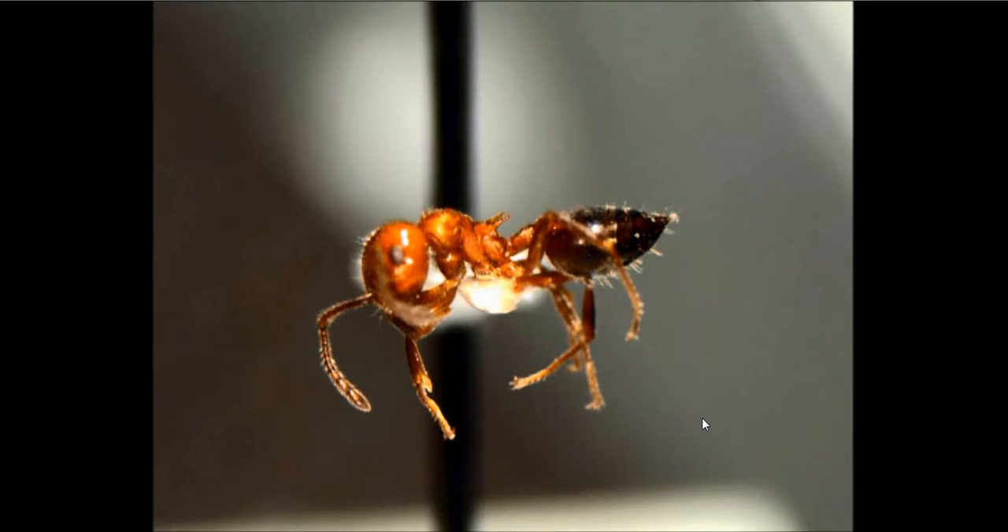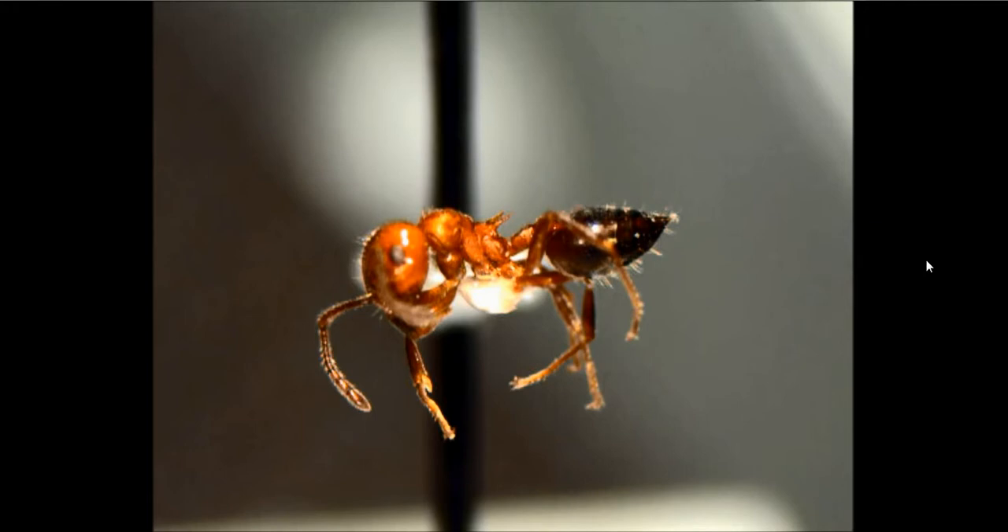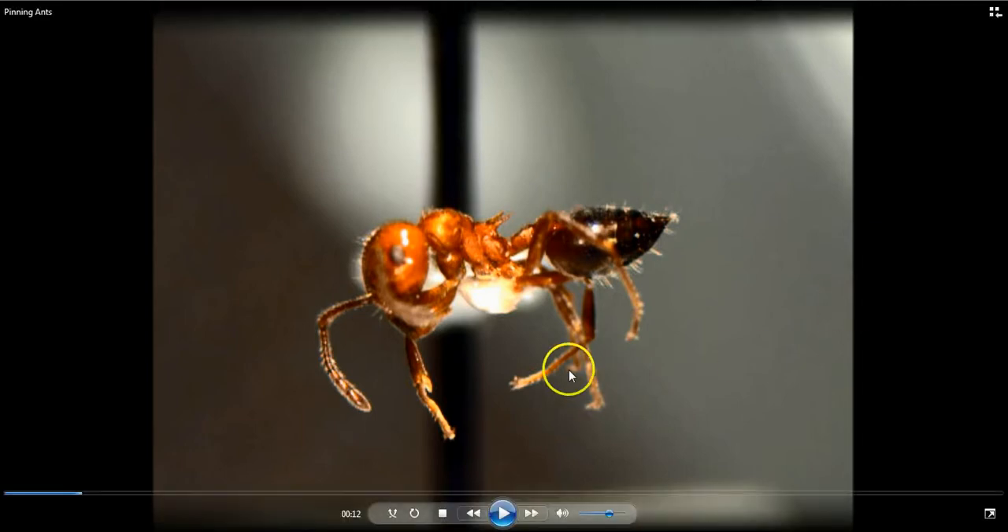The legs are not so important. Even in this case you'll see I didn't quite get one leg completely out of the way, but by tipping this ant and tipping the pin over, we'll be able to see that characteristic. This is a pretty good job. The main thing is the point needs to be under the ant, under the midsection, and the ant needs to be securely glued to it.